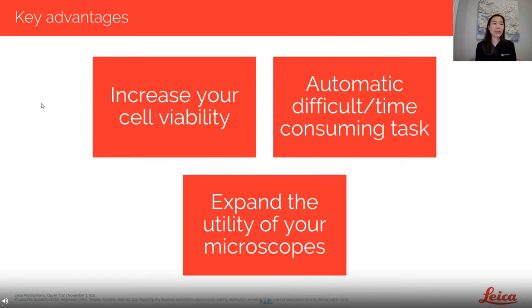So taking a bright field image, again, that gives you a scope that might be easier for you to access, or you really need that type of system to keep your cells viable, and take that image and transform it and predict something that allows you to, again, really delve into the complexity and answer some of those research questions that you're thinking of without sacrificing cell viability and the microscopes that you may have at hand that are readily available to you.